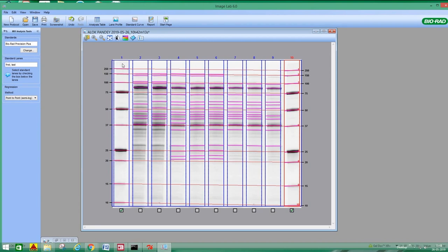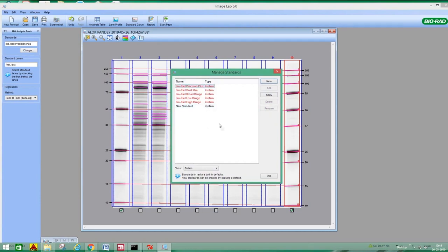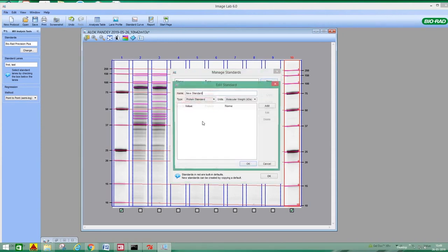If you are using your gel of interest, you need not worry, you just have to give your molecular weights. Suppose this is randomly taken, by default it has taken Bio-Rad Precision Plus. You can change this pattern also. Suppose you want to add some new protein molecular weight standards, you don't have this Bio-Rad Precision Plus, you have loaded some other thing, but you know what the bands are, from the first band on top to the lowest bottom band.